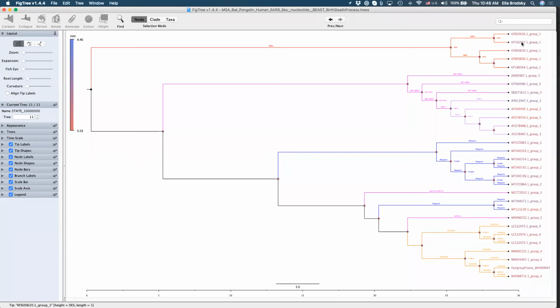So these are some of those input files. You can see group 1, group 2, group 3, group 4. You can see that obviously these groups are based on how you imported and put them into different groups. I used 4 groups, but I actually combined some of the different files that we had, like MERS and SARS-1, into one group.